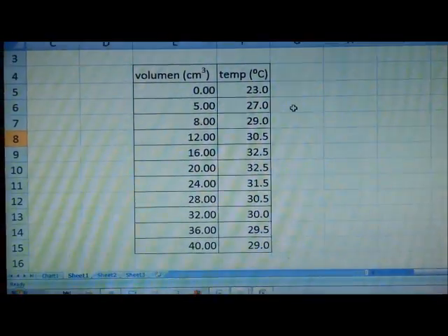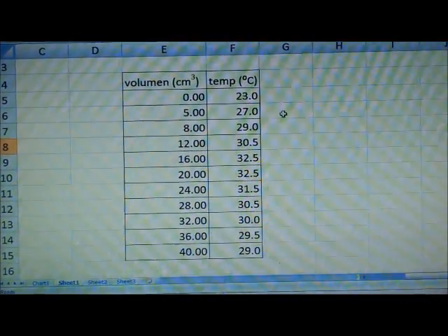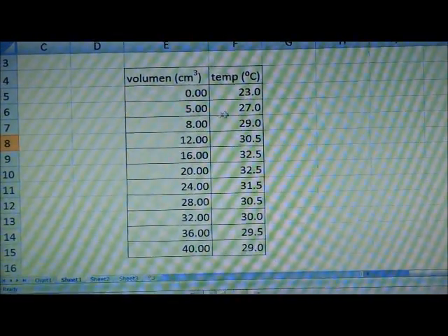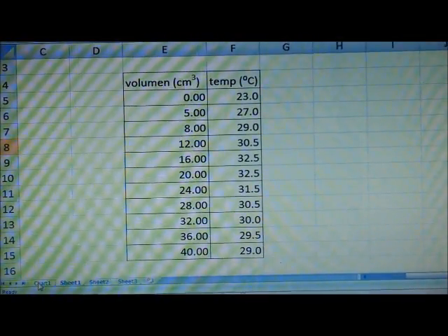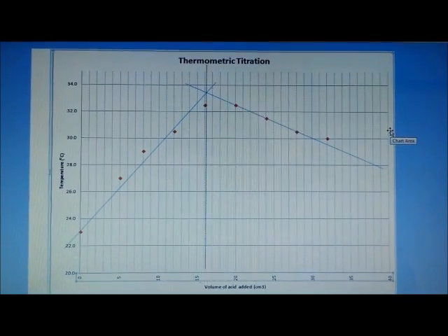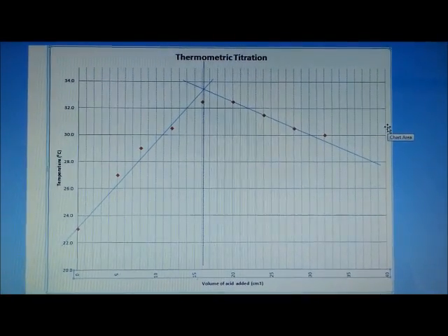Using Excel, I pass all the information and then I build up a chart using all the data that I collected. And you can see that there are several points that are marked.